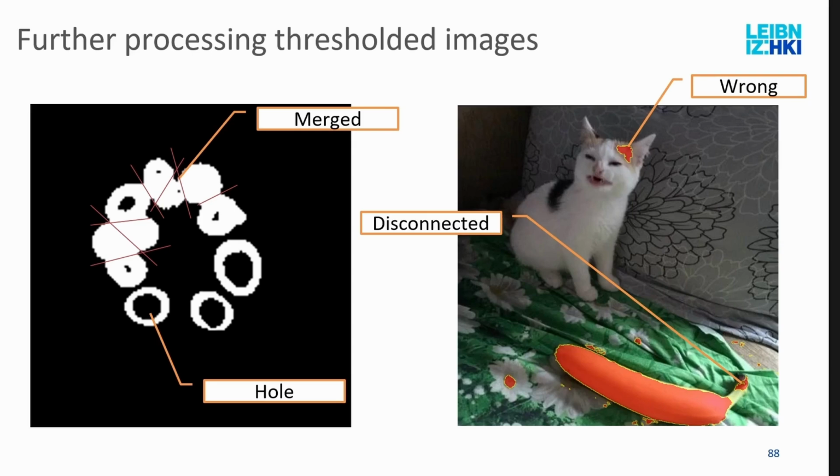These are extremely tool dependent. So ImageJ has different tooling than, for example, Imaris for these. JIPipe usually has the ones from ImageJ because it's ImageJ based, and they're also always named a bit differently. But general principles for binary images generally work.